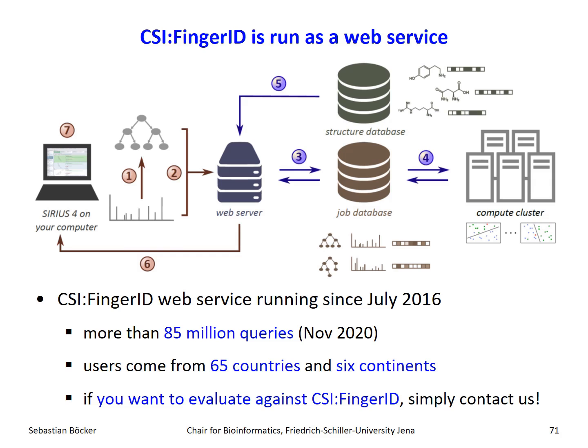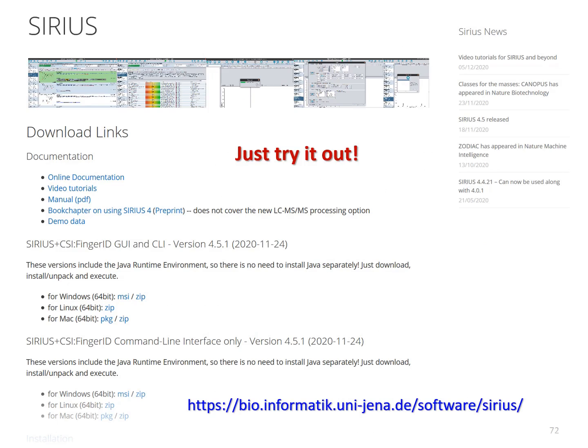So, as I said in the previous talk already, you can simply try it out. Download our software and play around with it a little bit. It now has a very nice option to actually directly read in MZML files, which makes it relatively easy. If you want to know how to get the MZML data into Sirius, just look at a different video tutorial that explains that to you.